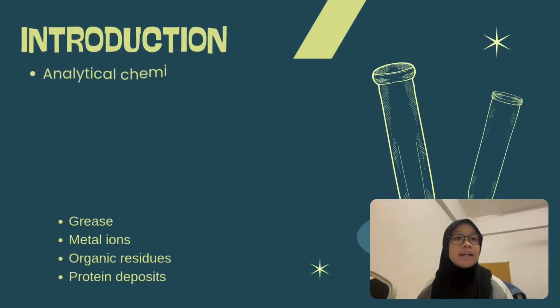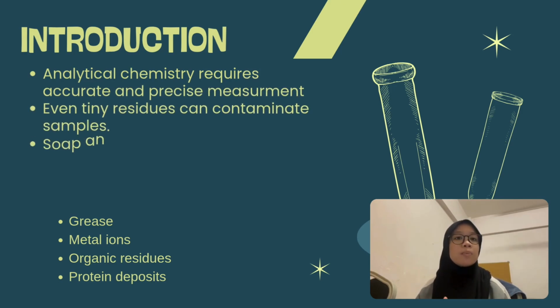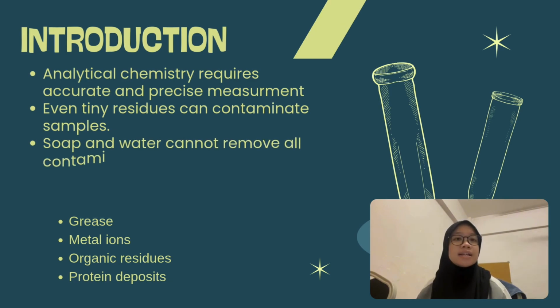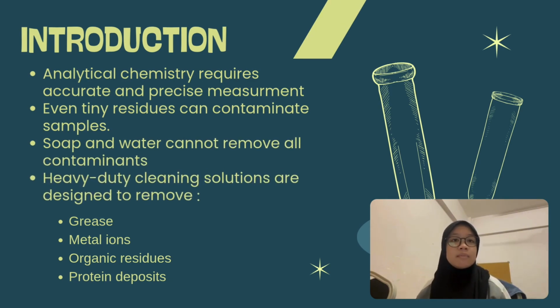Before performing an analytical experiment, one of the most important things is to ensure the laboratory glassware is completely clean. In analytical chemistry, even a small amount of residue left from the previous experiment can contaminate a sample and also affect the precision and accuracy of the result.